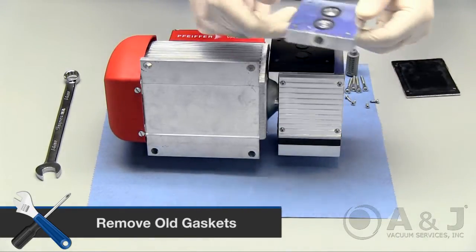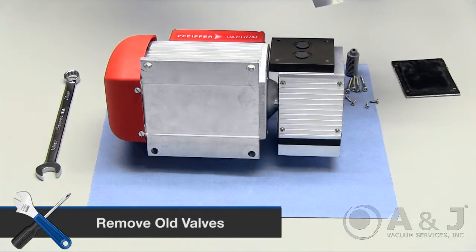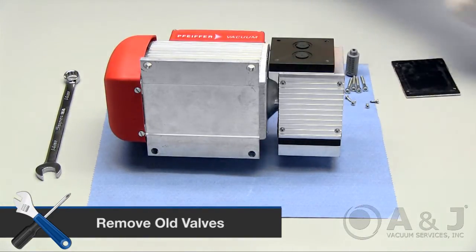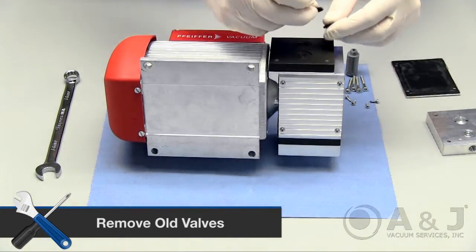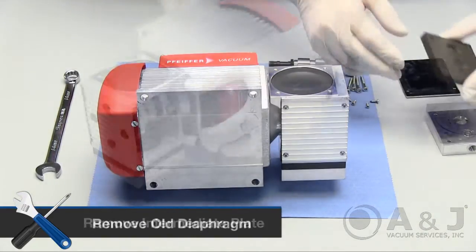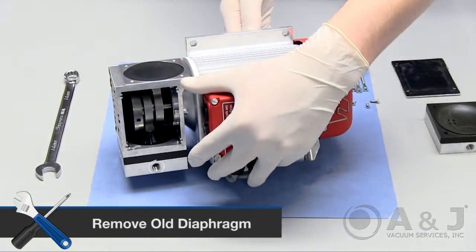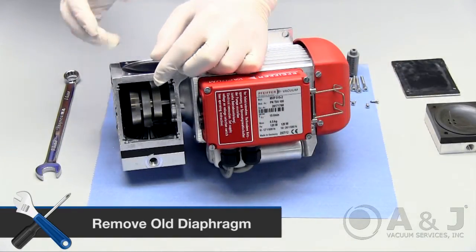Carefully remove the old gaskets from underneath the side plate. Then continue to remove the valves from the intermediate plate. Remove the intermediate plate. Turn the pump over and reach in from the inside of the crankshaft housing to start the removal process of the old diaphragm.